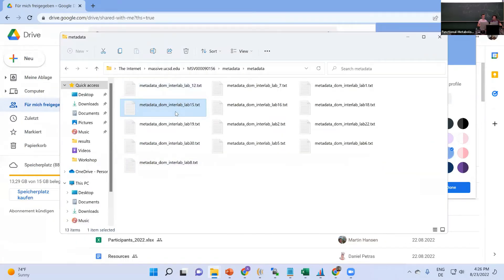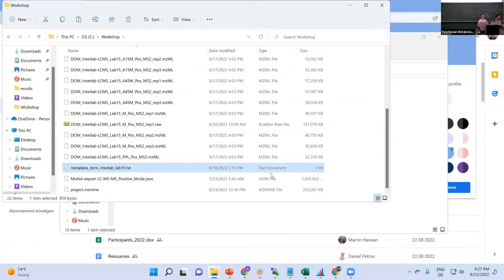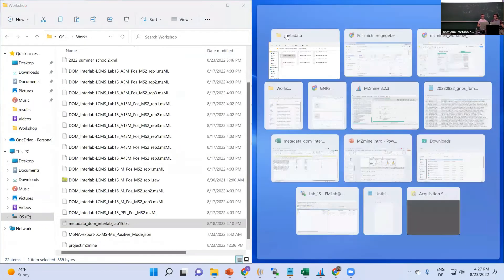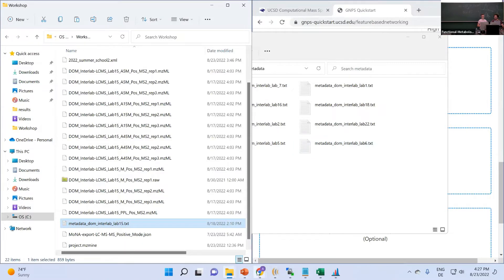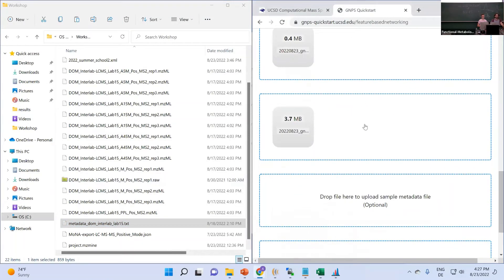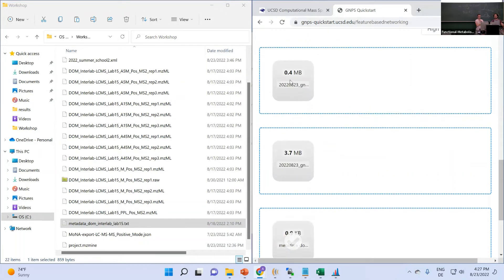On MassIVE you should find the metadata text files. You can copy them over to your machine as well. Then we go back to the submission page and you'll find the metadata file as the third optional file you can submit. For me it's lab 15, so I drag and drop the metadata file here. We've now uploaded the quantification table, the spectral MGF file, and the metadata.